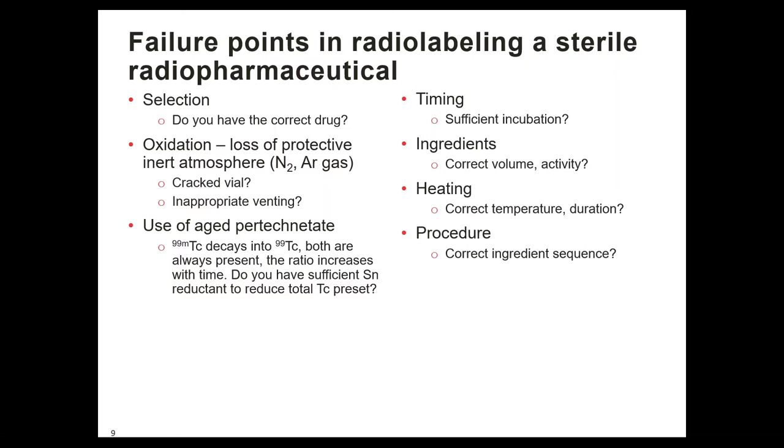Some of the drugs that are prepared require incubation. Neurolite, in my view, has room temperature incubations for a length of time. Most of the drugs have requirements for volume and activity. And if you're staying within the right parameters, you should have success. There are four drugs today that require heating, three of which are to boiling, one of which is not boiling, but warm. MAG3, sulfur colloid, sestamibi, and Netspot require a heating process.